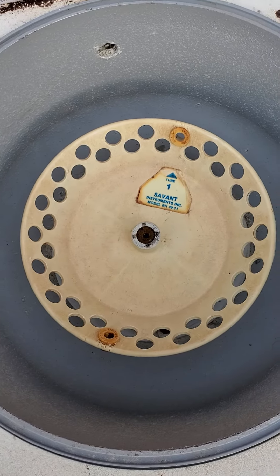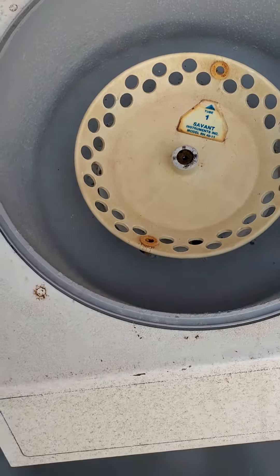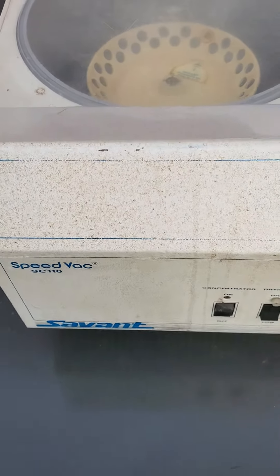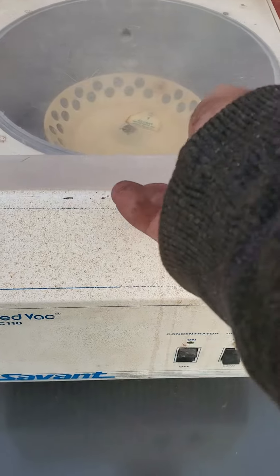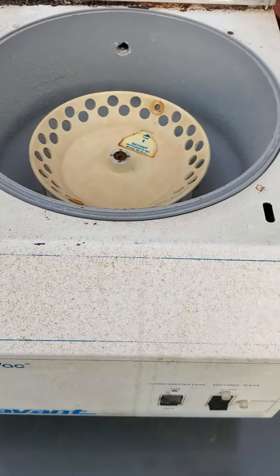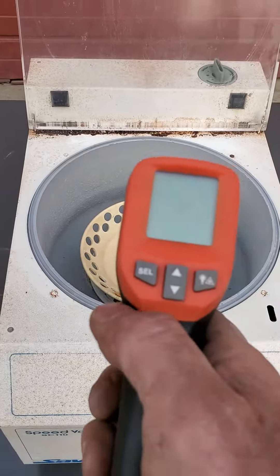It comes with a rotor, as you can see. And it does warm up and heat up very, very fast and furiously. We're going to actually show that right now with the thermometer.